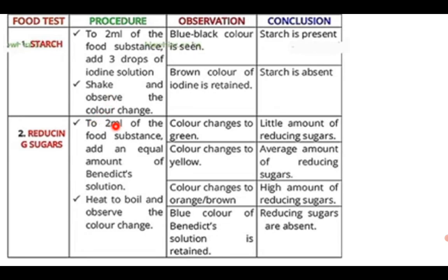So to 2 ml of the food substance, you add an equal amount of Benedict's solution.